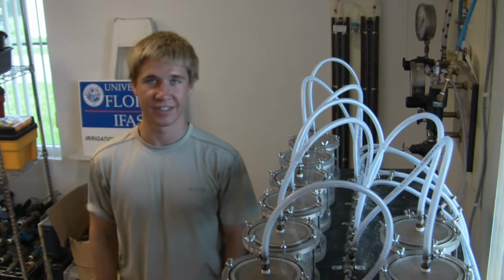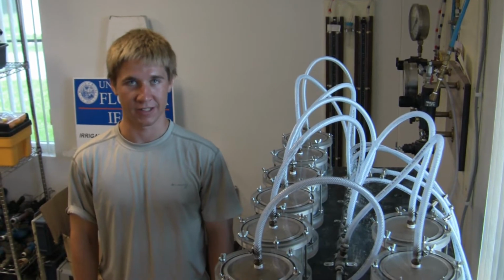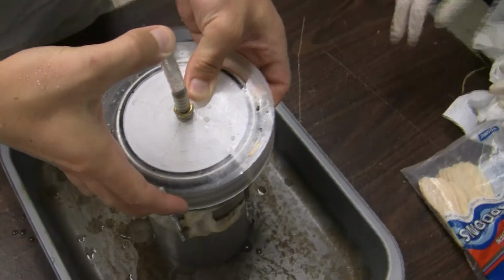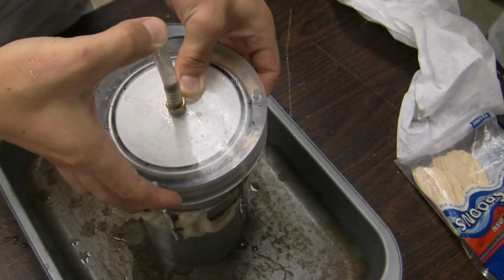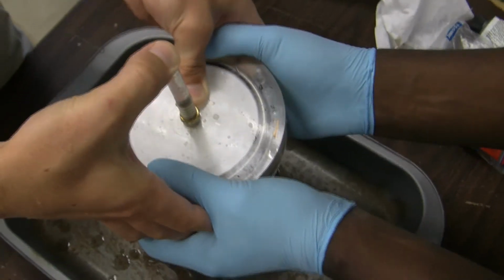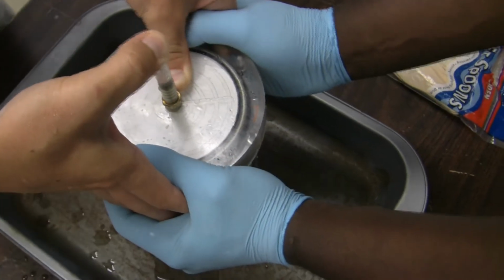A Tempe cell analysis is used to develop a soil moisture curve relating volumetric water content to soil water suction. Tempe cell analysis uses cores of soil samples to determine the volumetric water content at various pressures. The pressure is gradually increased from 0 to 1 bar, and the volume of water that is pushed out of the soil sample at each pressure is recorded. From this information, the volumetric water content of the soil at a given pressure can be determined.